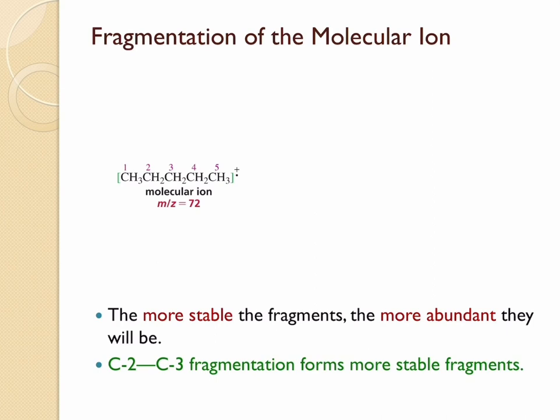So now we have two possibilities. We can break across the C1-C2 bond or break across the C2-C3 bond. Let's do the two different scenarios and find out what fragments we'll be getting. Okay, now let's break across the C1-C2 bond.